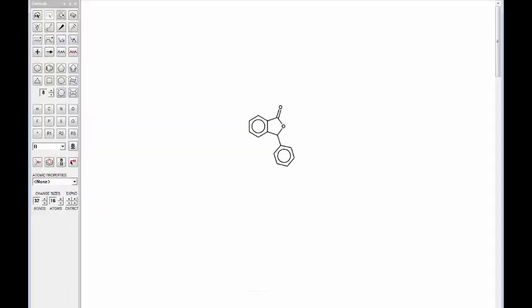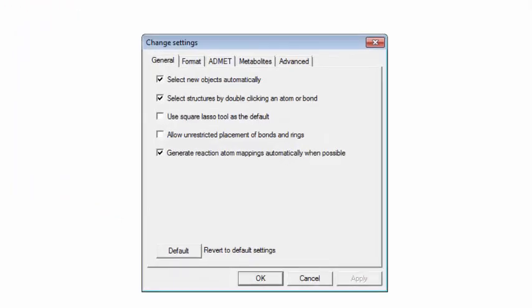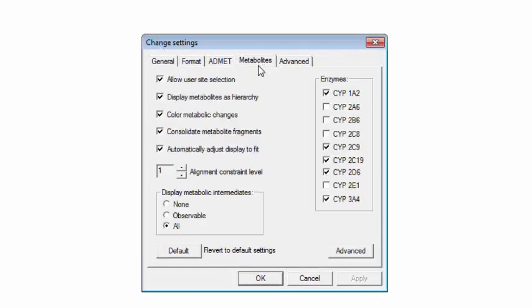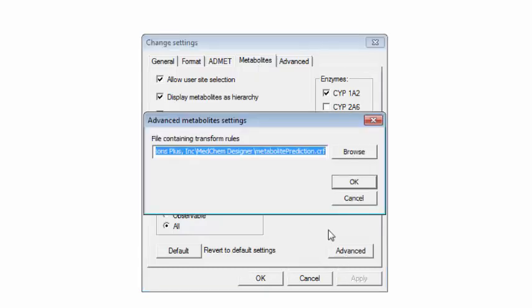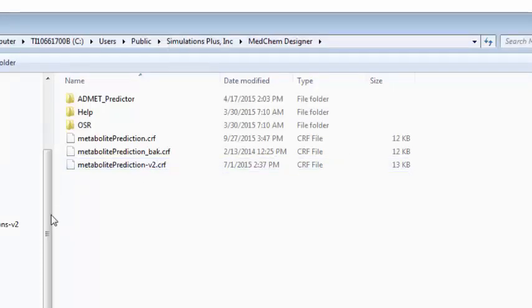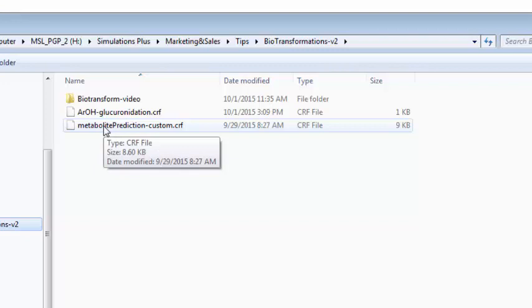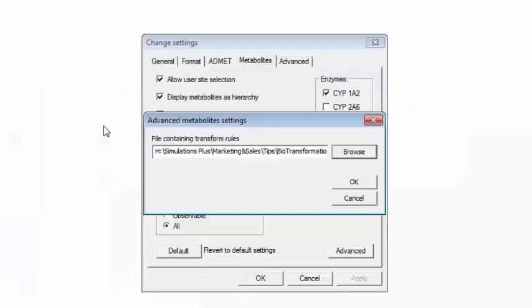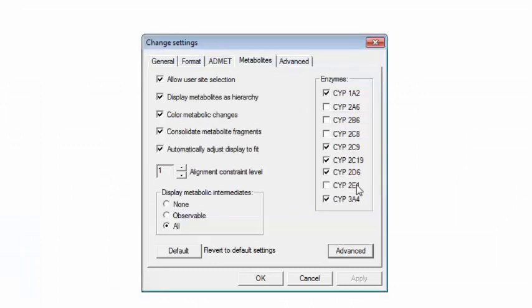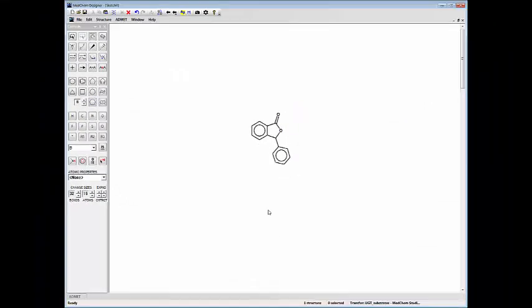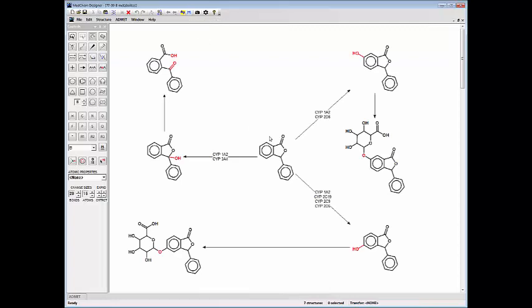So we can specify the custom file by going into the change settings dialog box, clicking on the Metabolite tab, and then clicking on the Advanced tab and this is where we would specify the transformation rule. So I'll browse to the customized transformation file that I've created. So this file was the original Metabolite prediction and then I've appended a new reaction to the very bottom of it that specifies the glucuronidation. So double click on that and then click OK a couple times and then click on the M button. So now it hydroxylates in this position and then glucuronidates that OH group in the final step.